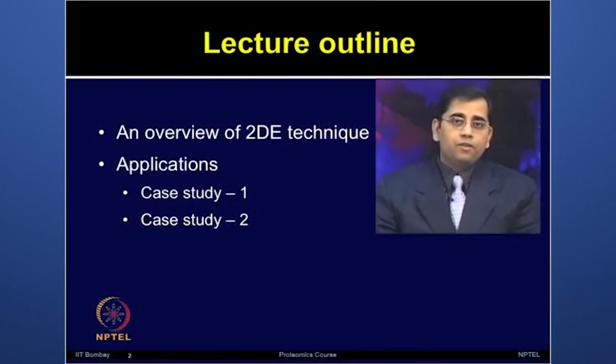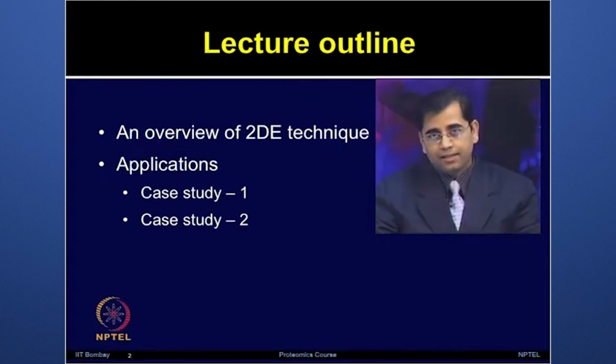All of this knowledge integrates when you want to apply these techniques in any biological application. So, today I will first give you an overview of the 2DE technique, just to refresh you about various things which we discussed in this module. And then I will give you a few example applications. We will take two case studies.